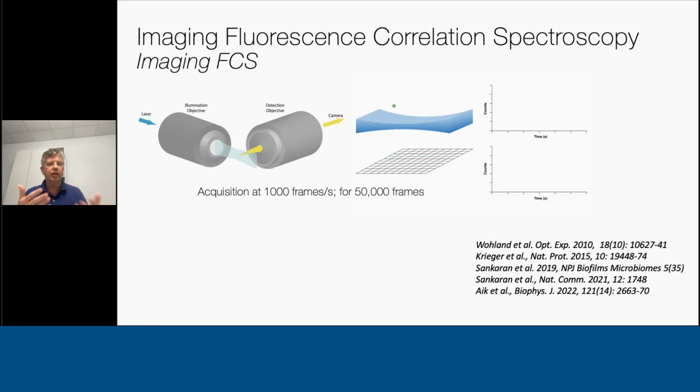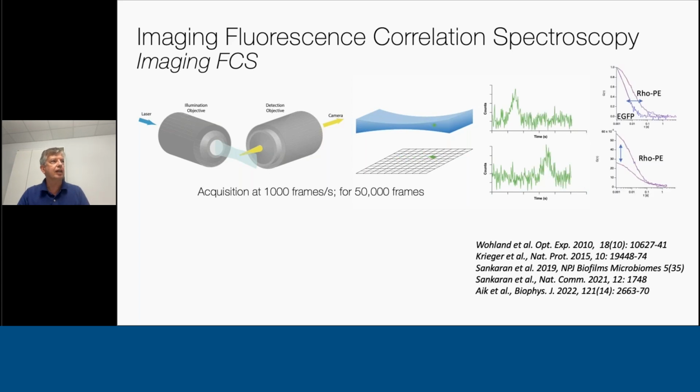And you can imagine that from the number of peaks, etc., you can also get concentrations in your sample. So as an example here on the right side, these are correlation functions. These correlation functions allow you to statistically treat your signal, and they measure the average width of these peaks you see on the left side.